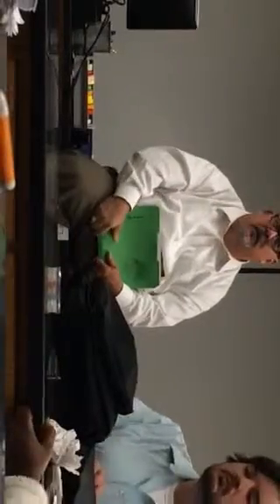So what you should be seeing when you eventually get there is it spreading out? Can you tell whether it's spreading out? Yeah. What you should see is a reaction.